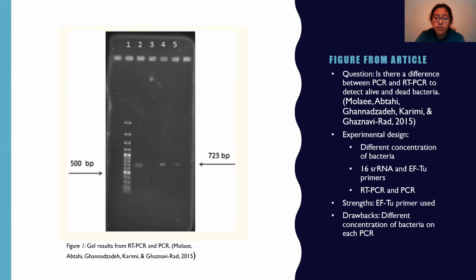The reason they were asking this type of question was because they had noticed that PCR was giving false positives in regards to this type of research.